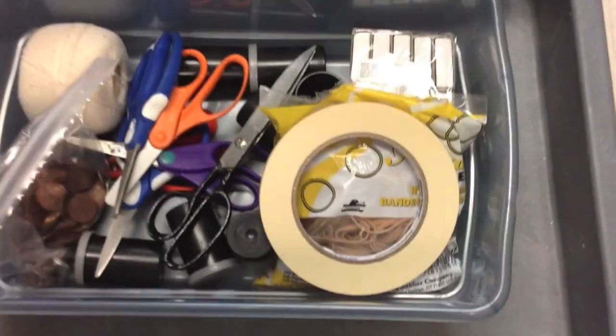After you have conducted the lab, the cleanup is just as simple. Place all of the reusable items back into their proper bin and remember to keep an inventory of your items that you have used.